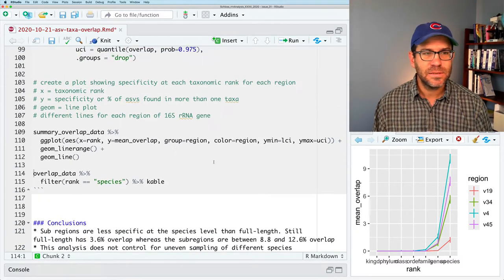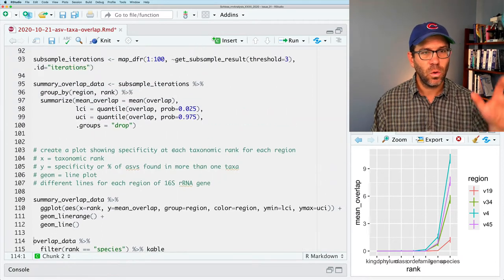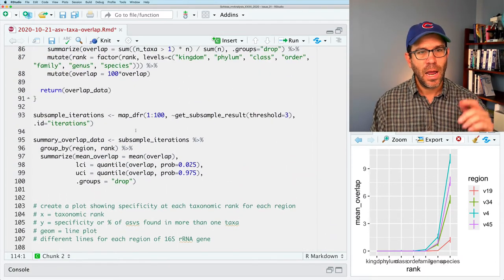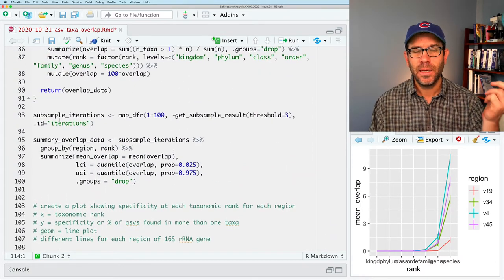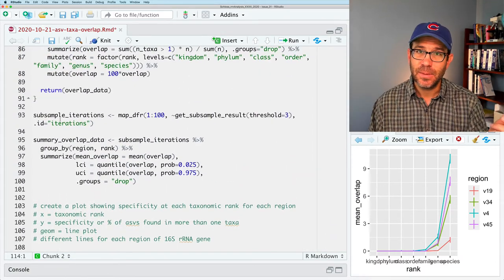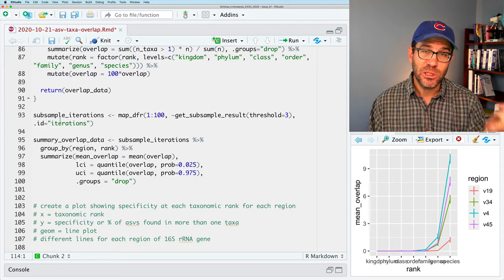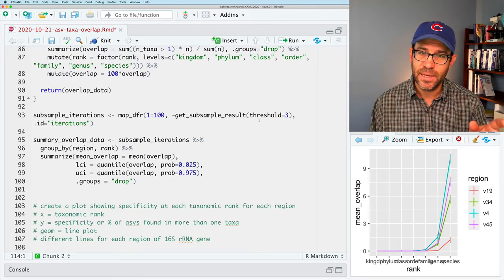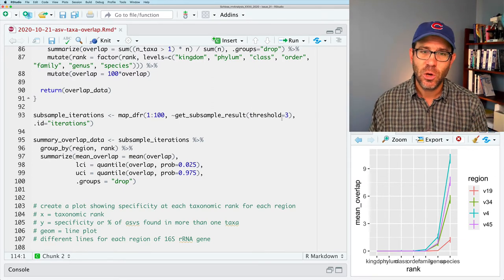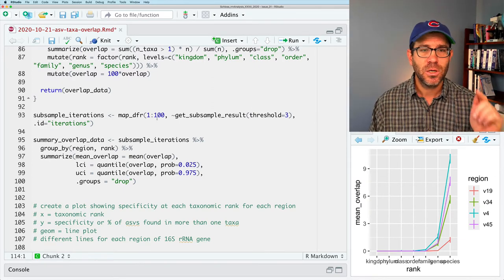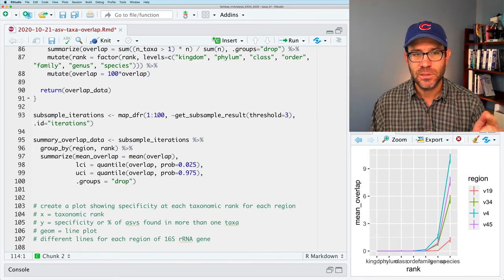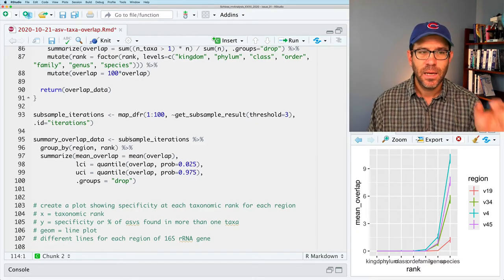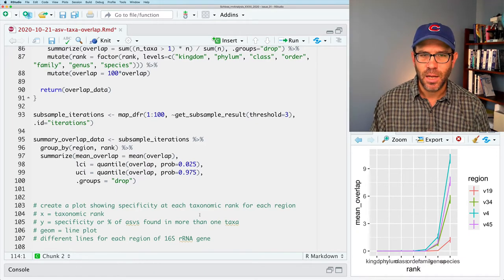So again, this is the whole flow for how we would subsample our genomes, you know, in this case, three genomes per species, doing it 100 times, and then make the plot. What, again, if we're testing things out, maybe I'll do 10, and let's try 1 and see what happens.